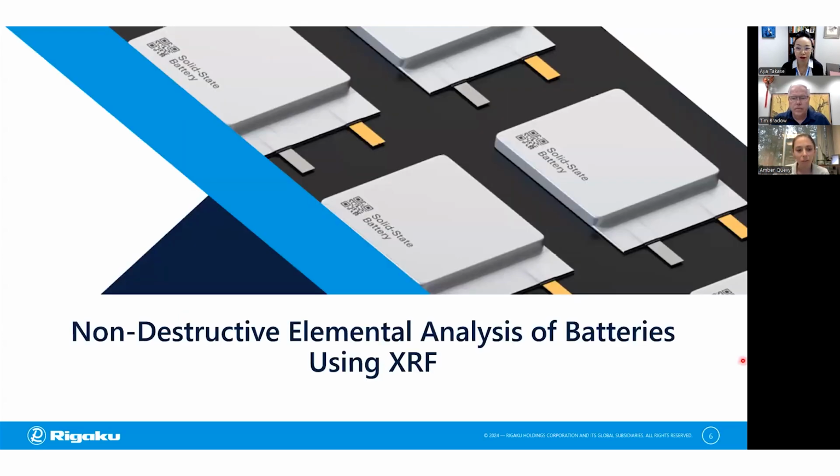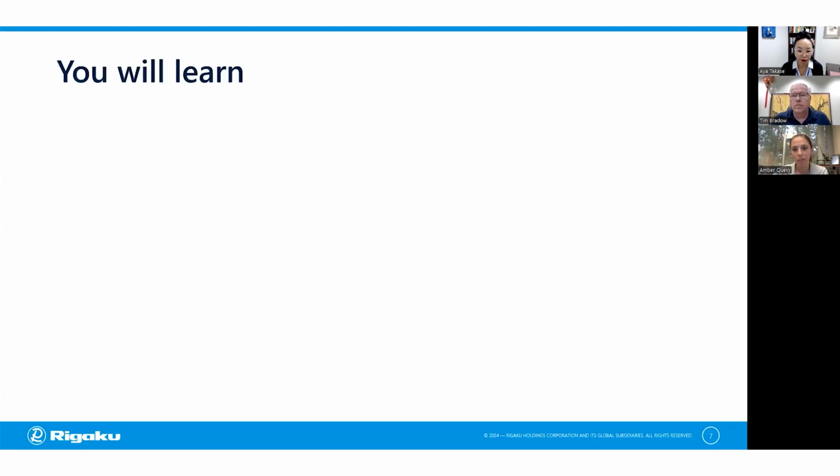Thank you, everyone, for taking the time to attend. Like Aya said, we're talking about non-destructive elemental analysis of batteries using XRF. Through this presentation, we hope you'll learn what XRF is. XRF analysis may not be widely used in the battery space for some, but this technique can be used in a wide variety of ways.